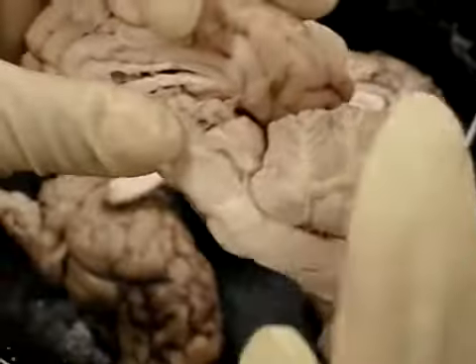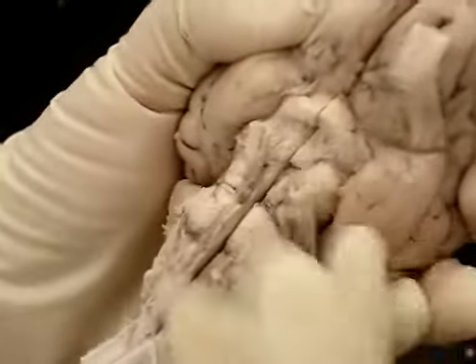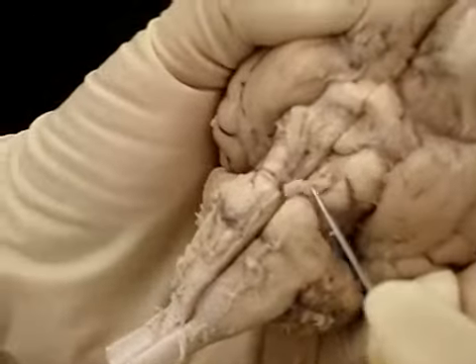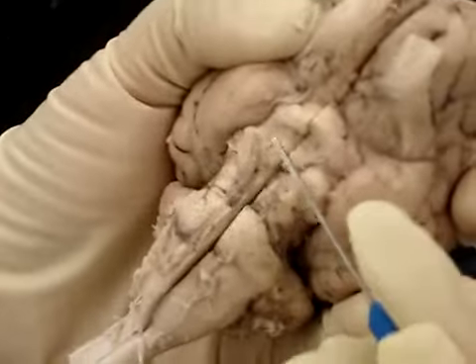The cerebral peduncle is this area, and if you notice, the oculomotor nerve or cranial nerve number 3 comes out of it. So there's the cerebral peduncle.